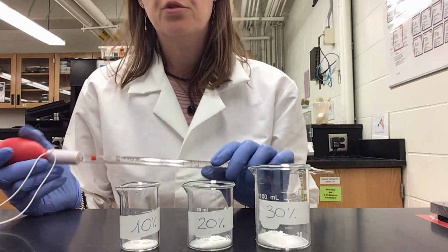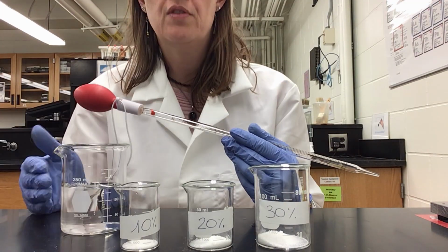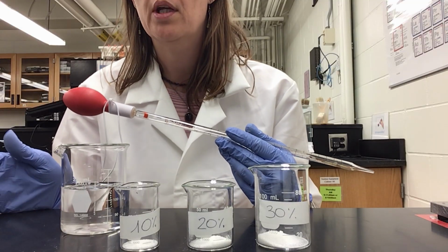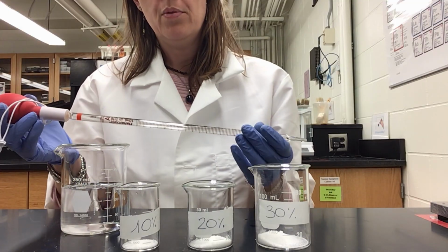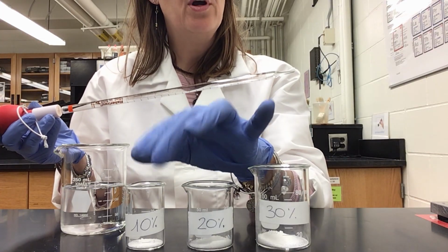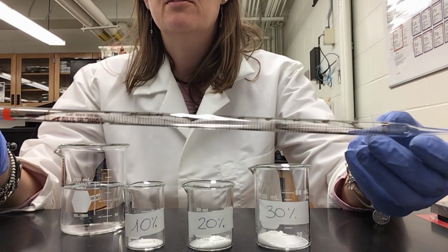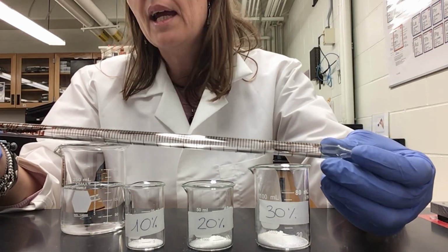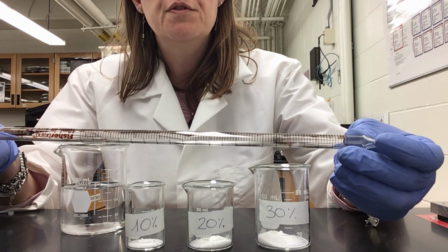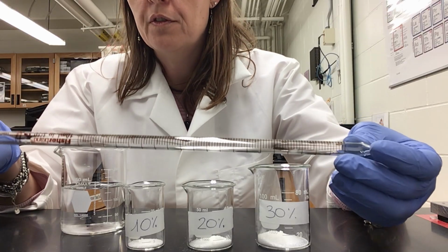So now, to finish my solution, I need to take the water, which temperature I measured earlier, and I already told you that it was 20.1 degrees. Remember that for 10%, I needed 13.52 milliliters of water. Now, our pipette measures up to 10, so I'm gonna divide this measure in two. One of 10 milliliters and the other one of 3.52.